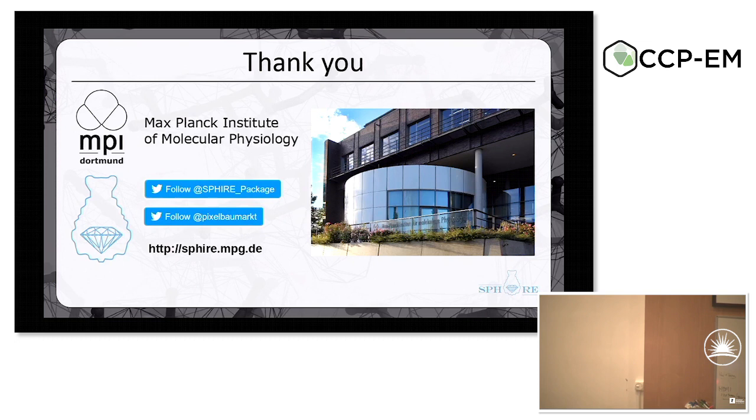Do you think there's much value to the positive unlabeled framework if it's this easy to correct for? I guess it solves the problem in a very elegant manner. So, of course, this is a cool contribution to the field. And it might be that this is also the better way of doing it. But what I would like to show is that crYOLO still works, so that's not a problem if you train it with sparsely labeled data. Perfect, thank you. Sure.